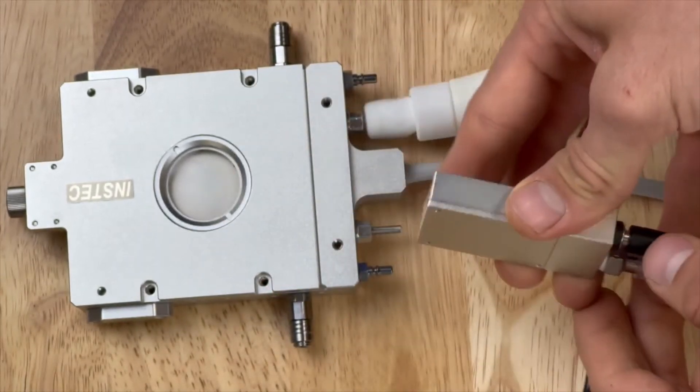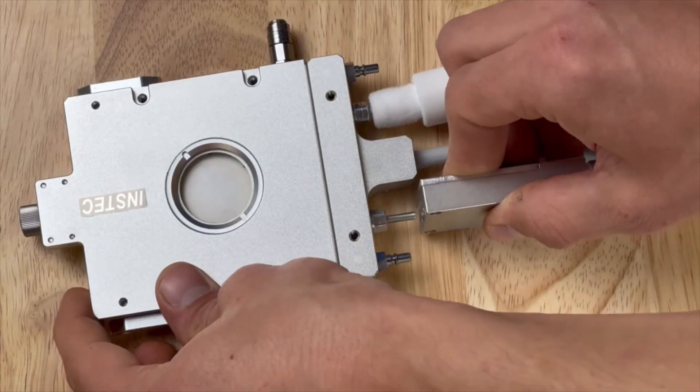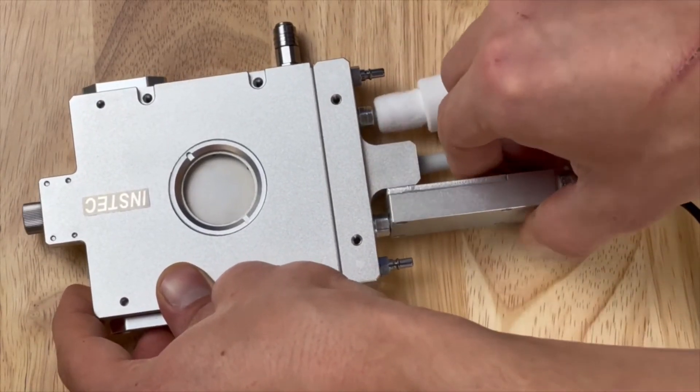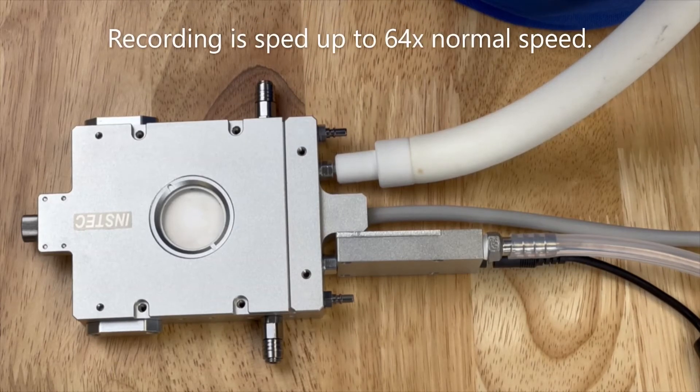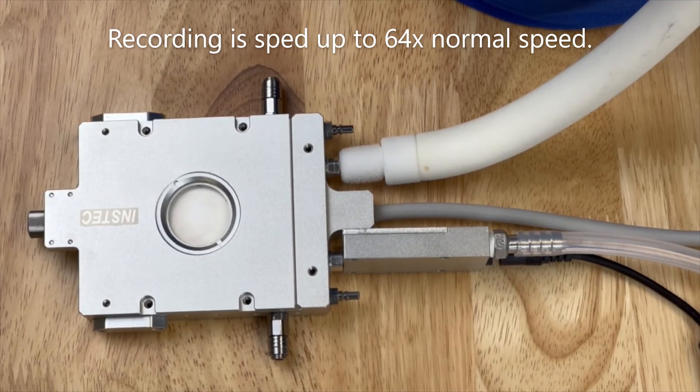This is a simple addition to any existing INSTEC system that allows you to run long duration experiments without any ice formation. This footage is sped up to 64 times normal speed and you can see that while some ice formation does occur on the inlet tube, no ice forms on the uninsulated LN2 outlet.